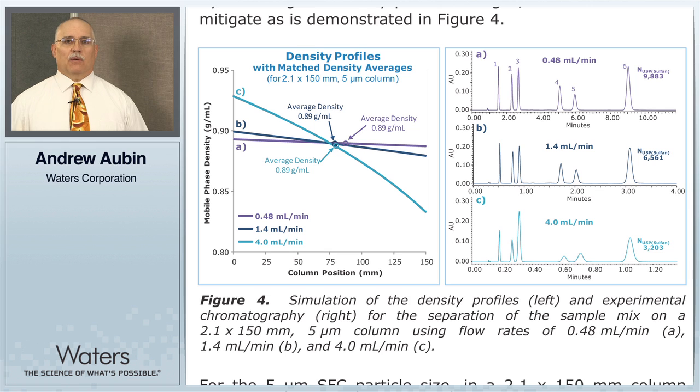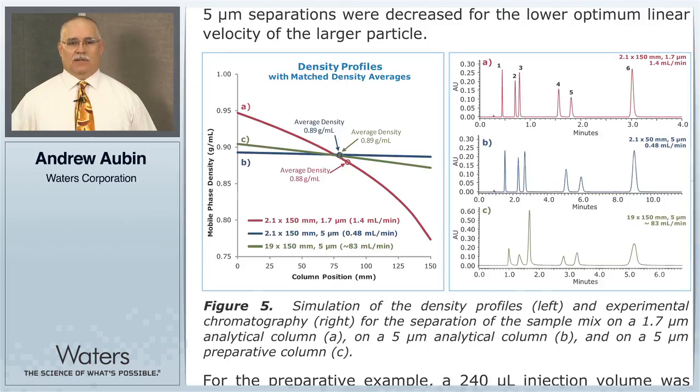If we were to do this in liquid chromatography, it would be very predictable and work every time without any changes to the method. In SFC, we do have to modify the pressure parameter to keep our carbon dioxide density the same. So what does this mean in a practical example?